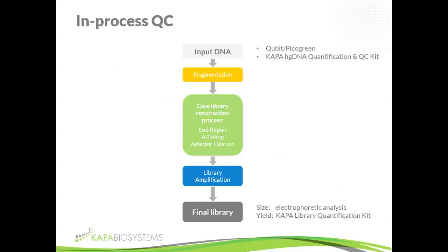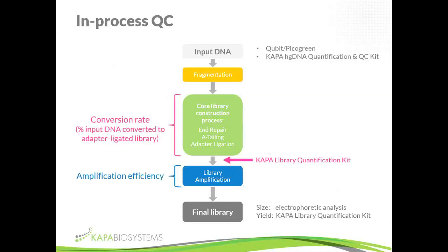The sort of in-process QC that we really recommend people doing, especially when you're comparing kits or optimizing protocols, is doing some quantification after ligation. So this is after the ligation cleanups, once you've gotten rid of all the adapter dimer and all the ligation reagents, to do qPCR at that point.